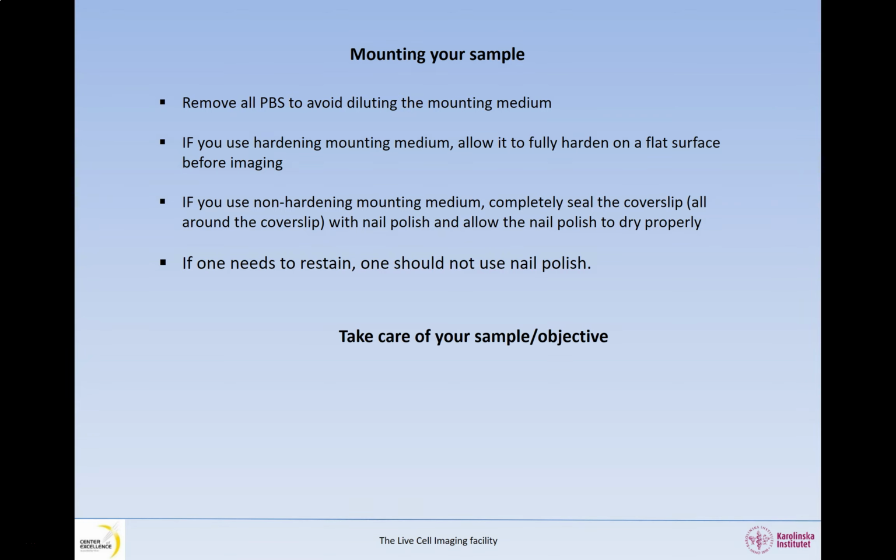Quite often, at least when you have your cells or tissues on the cover slip, due to all the washing steps during immunostaining and after drying, you will see a kind of white haze on the surface of your cover slip. Those are salt crystals from the PBS, which you should remove, since I am convinced that you do not want to image that. So before imaging, remove salts by cleaning the top of the cover slip with a drop of water.